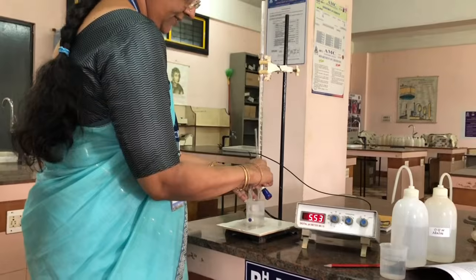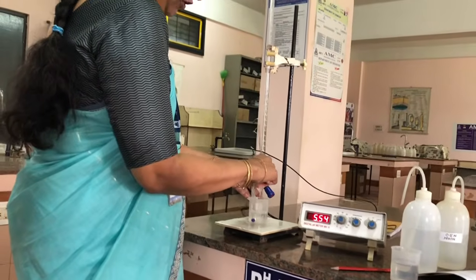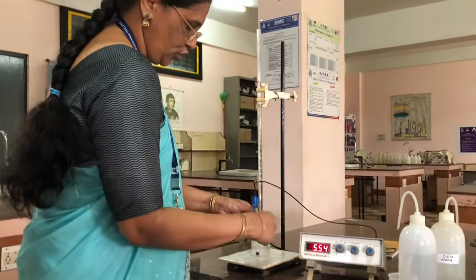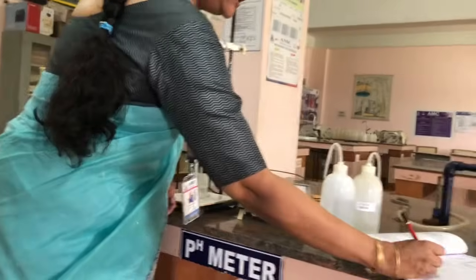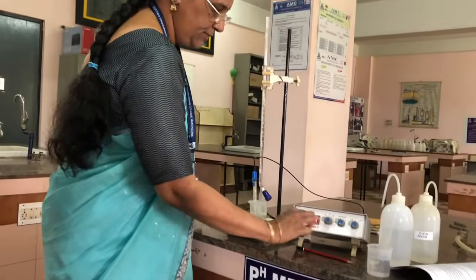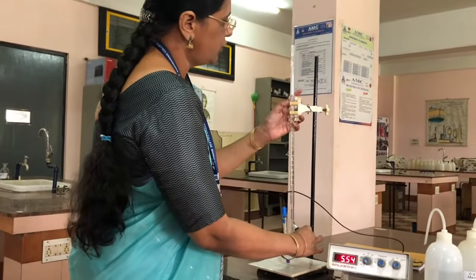It's a very simple experiment you have to follow, but while you are doing the experiment, you should not touch any of these knobs which are fixed to the instrument, because the instrument is calibrated. Simply you have to measure and note down the value it is showing.